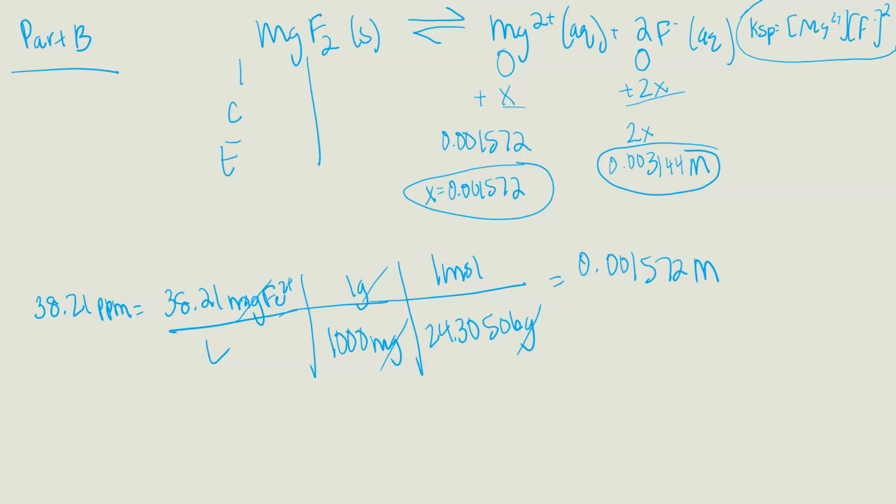Okay. So calculation-wise, as long as you don't have to do the graph, they're really not too bad. You made up for it with all the centrifuging and the vortexing, though. The post-lab questions: for number 4, you do have to know your average solubility product, your average KSP value, before you can do number 4. So don't wait until the last moment.